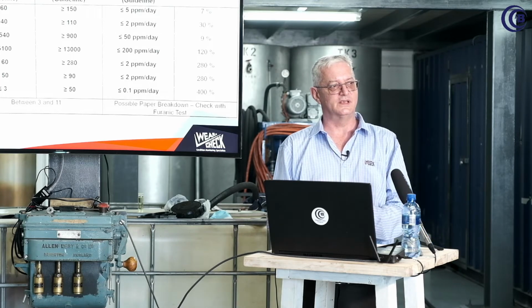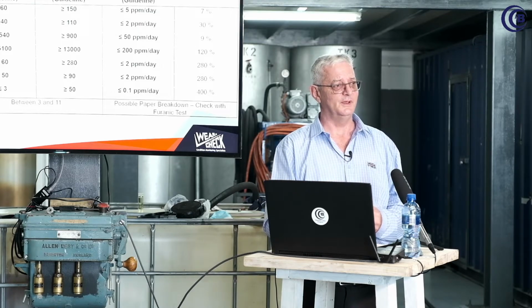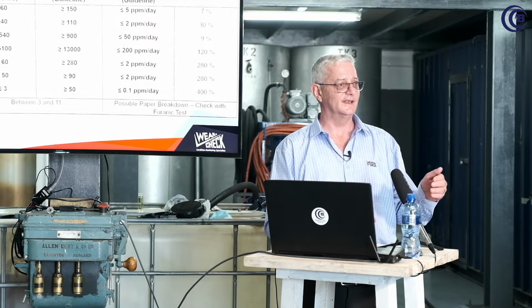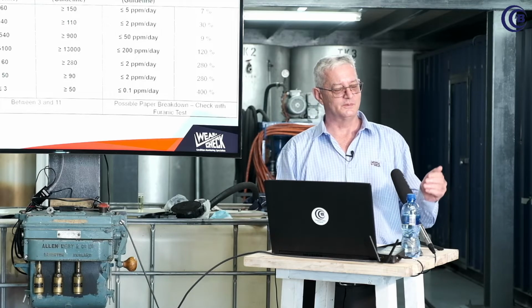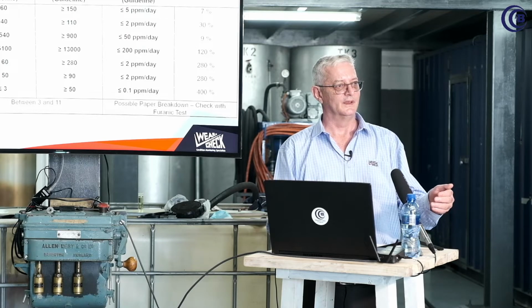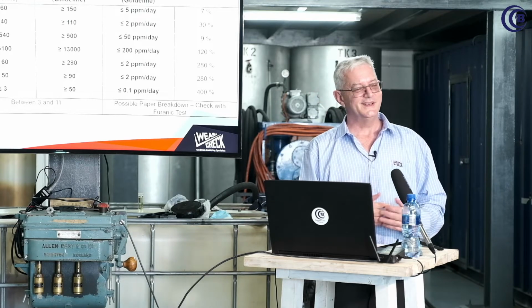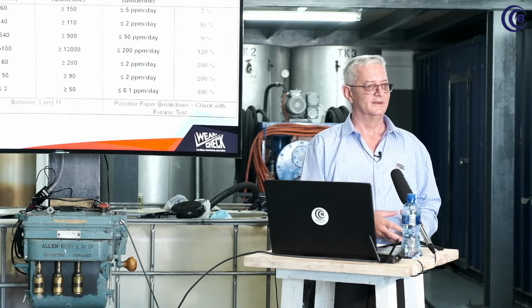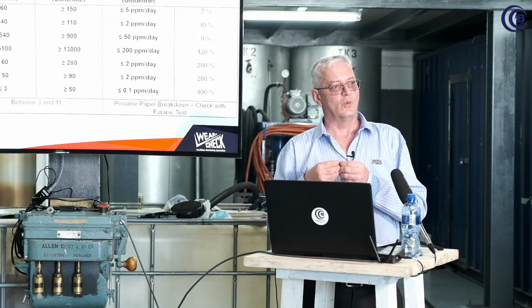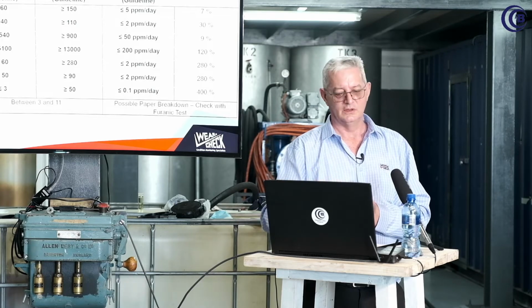So it's not just values that you need to look at. For a distribution transformer, if it contains 5,000 ppm hydrogen, that's a problem, and someone needs to go and stand quite a distance away already and take photos. If it's a wind farm transformer, 5,000 ppm is relatively normal. And the same with a furnace transformer. So the type of transformer also plays a role. So there are no specific values. It doesn't work. This is just your lamp to start showing you where you need to start looking at your gases, irrespective of which one you want to start looking at.